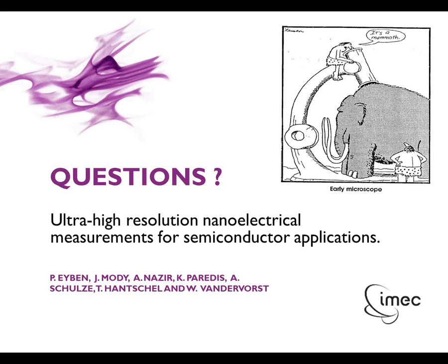So we are now able to get surfaces where after 1 scan, or even the first scan when you go at higher pressure, we are on a surface which is no more contaminated with gallium. It's not that we are avoiding gallium completely. By the lapping, by really the small angle, and by the lowering of the energy, we are able to reduce the penetration of gallium to a few nanometers.